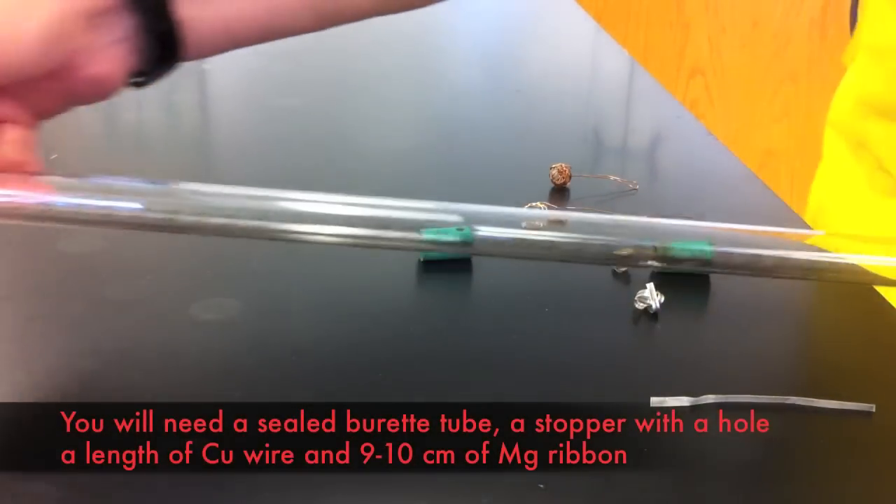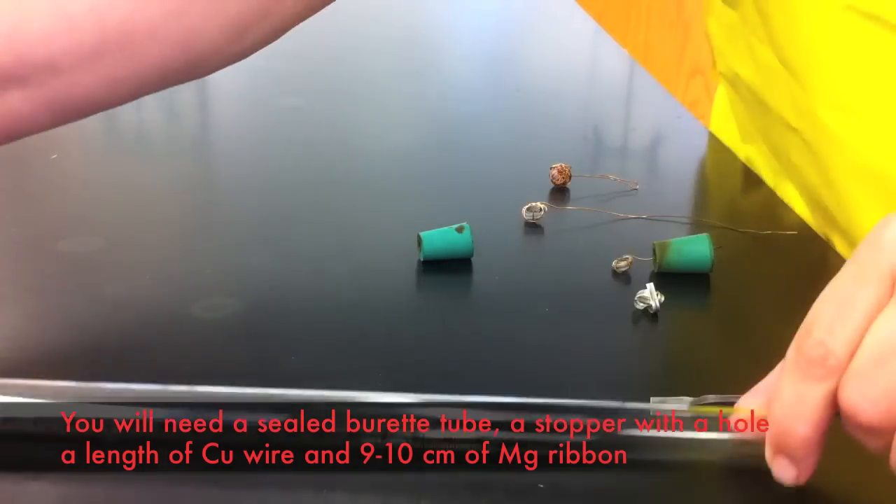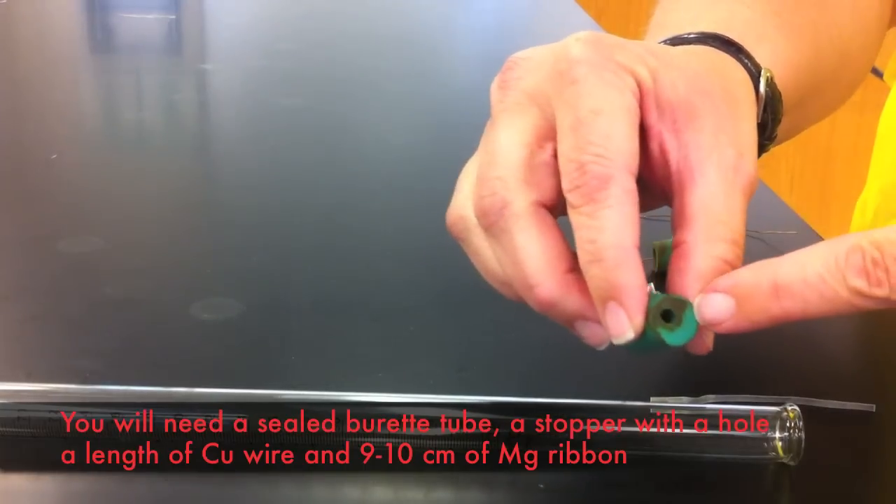In order to do this, you will be given a burette tube which is sealed at one end, a rubber stopper with a hole through it, and some copper wire and magnesium ribbon.